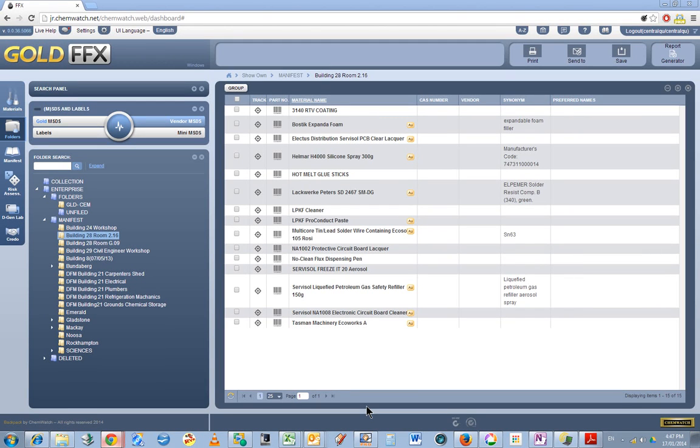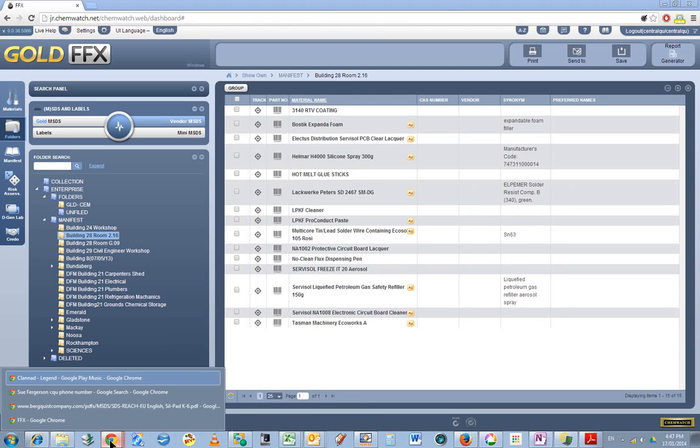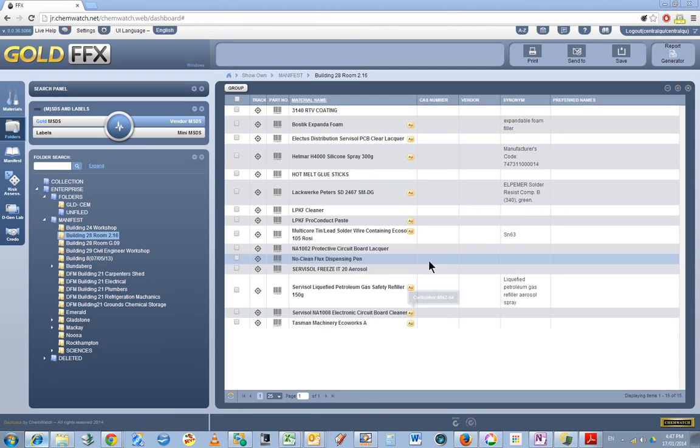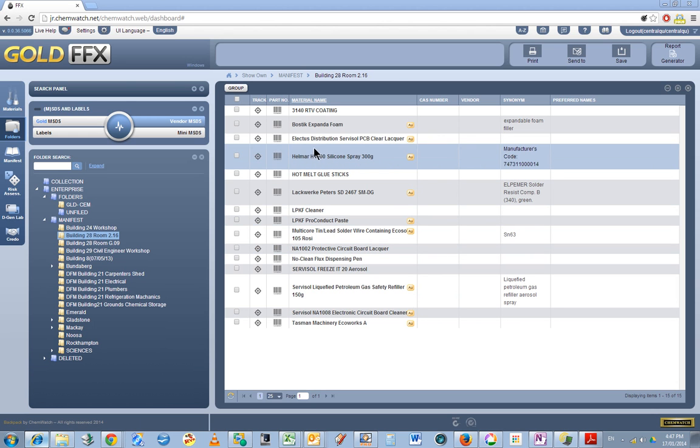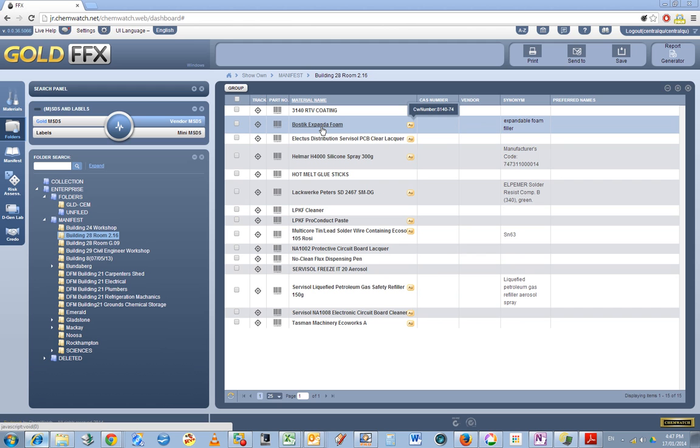I've got the new ChemWatch MSDS management system called FFX. I've previously talked about logging into that and a bit of comparison between the old system and the new system. Now I have to make sure that I've got all these MSDS sheets up to date.